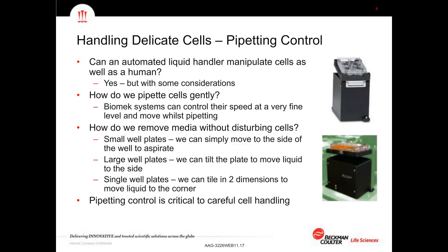Pipetting control is absolutely critical to careful cell handling. As I said earlier on, this is a software issue, and how we take control of that pipetter really defines how we're able to recreate some of those potential issues we might face in transitioning from a manual process to an automated one.